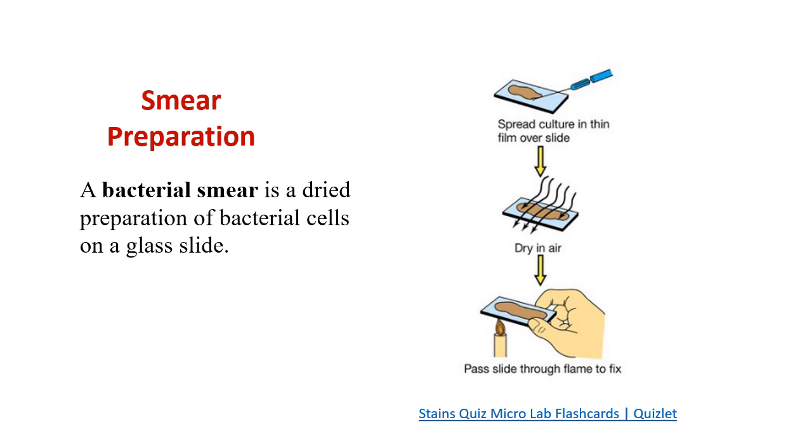So once you make the smear, next is how to see this smear. To see the smear, you need a contrast. For this, you can use simple staining or differential staining, or some special staining technique that depends on the microorganism you want to see and you are suspecting in some sample. Suppose you are suspecting Mycobacterium tuberculosis, then you will not go for simple staining, you will go for acid fast staining. But if you are suspecting Staphylococcus aureus, you will go for differential staining. Or if you just want to see whether some sample has bacterial cells or not, or just the shape of bacteria, then you can go for simple staining.